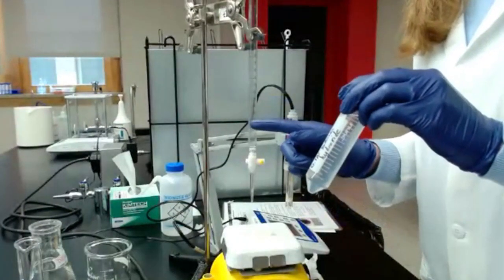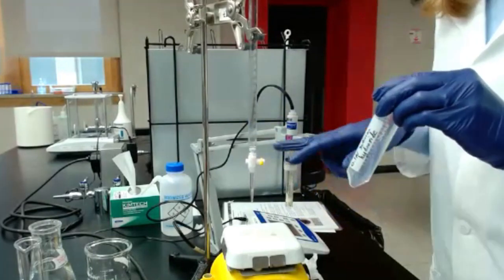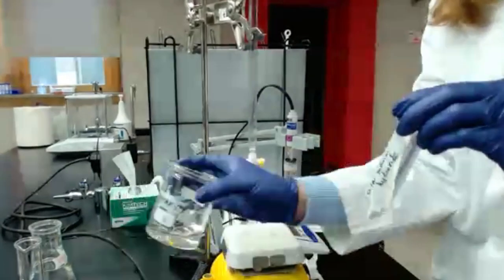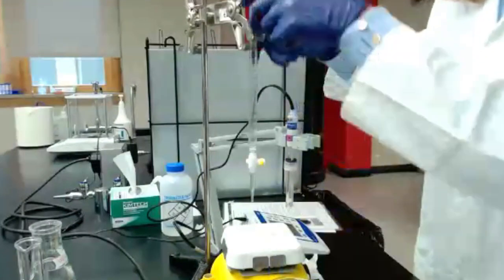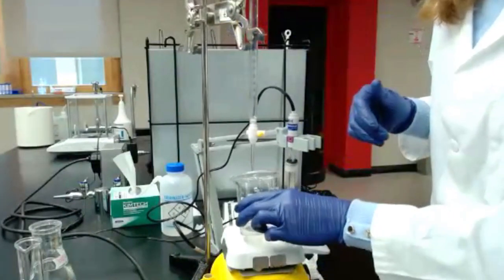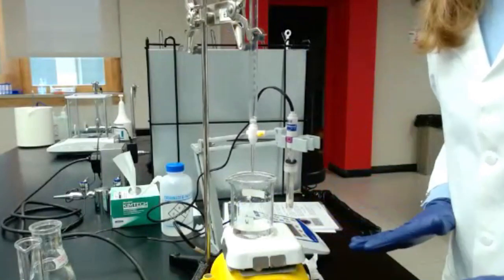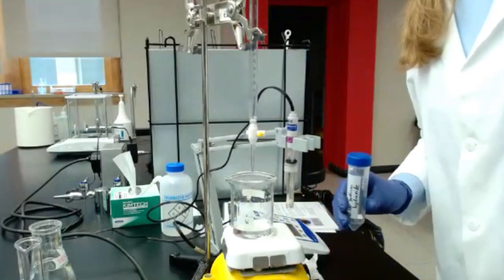Before filling in the burette with our solution, we need to make sure the tap is closed, because we don't want to have everything leaking everywhere. We want to make sure we have a waste container, like a beaker at the bottom, especially because it's a base, corrosive, and you don't want that solution anywhere in your working space.